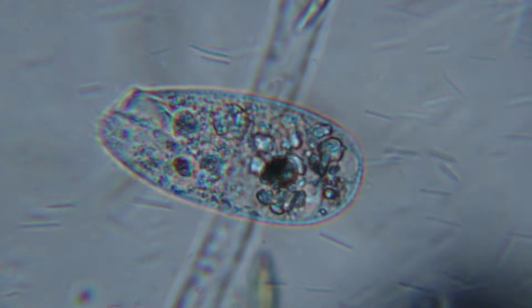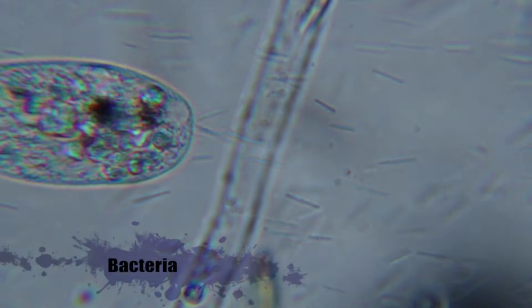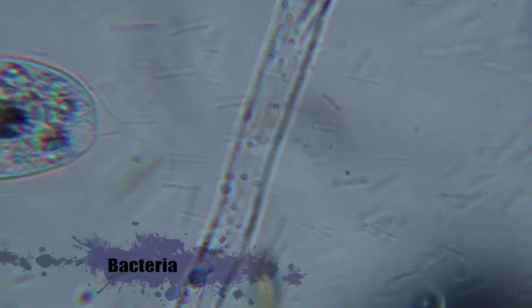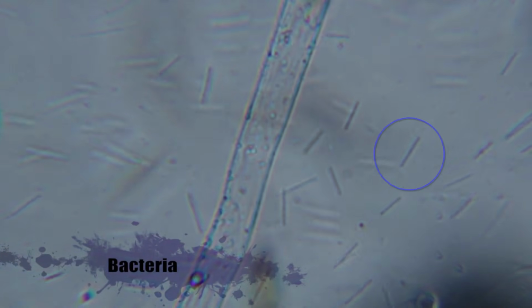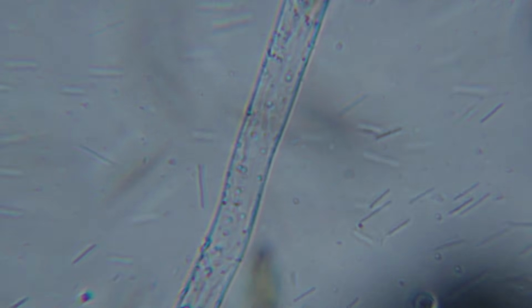The small strands that you see moving back and forth are bacteria, and these are so small that they approach the wavelength of visible light. This makes them very difficult to observe in detail under a conventional optical microscope.